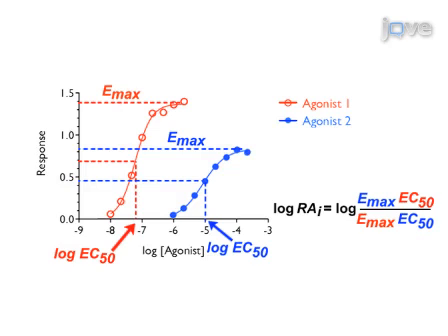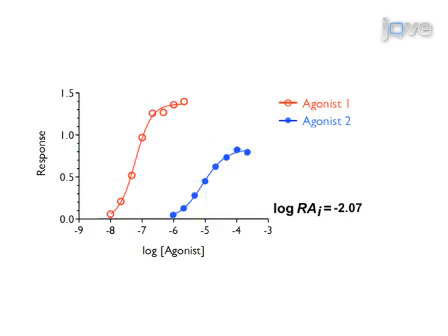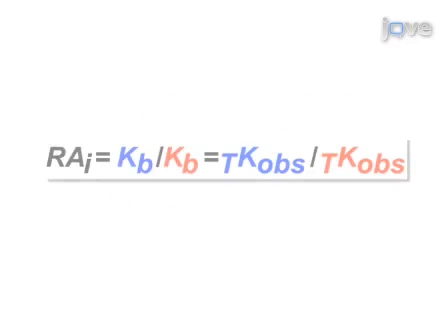As a final step, relative estimates of the affinity constants of agonists for the active state of the receptor are obtained using global nonlinear regression analysis of their concentration response curves. Ultimately, using a modified form of the operational model, the affinity constant of an agonist for the active state of a receptor, expressed relative to that of another agonist, can be estimated through global nonlinear regression analysis of their concentration response curves.